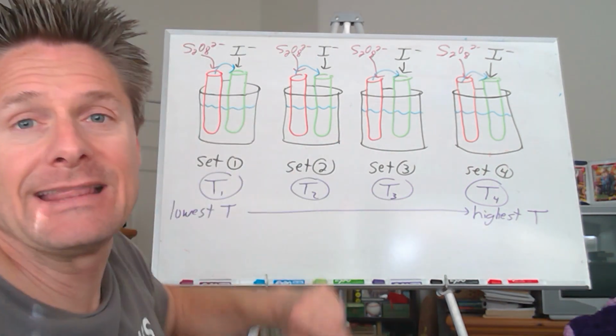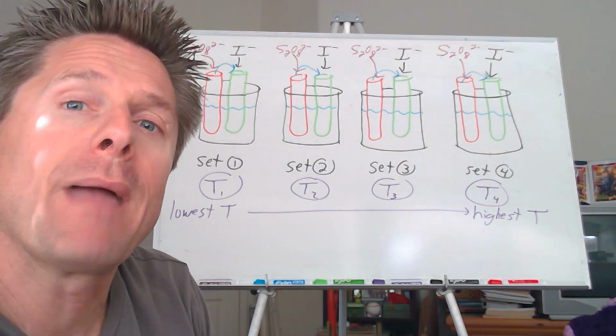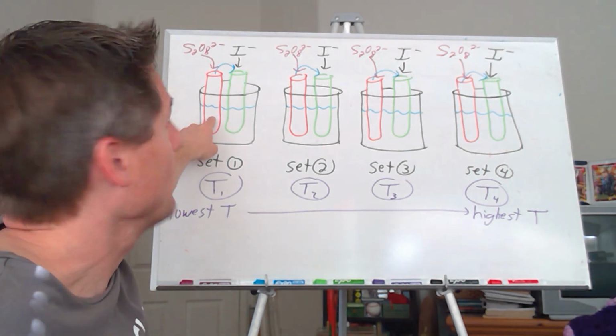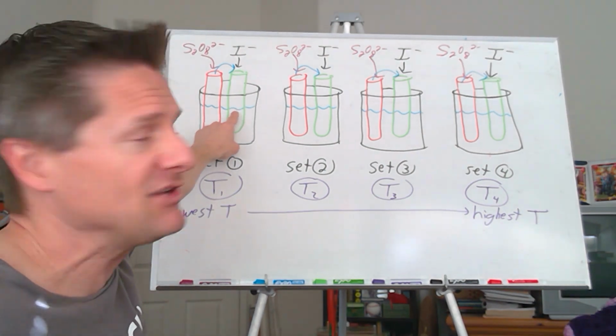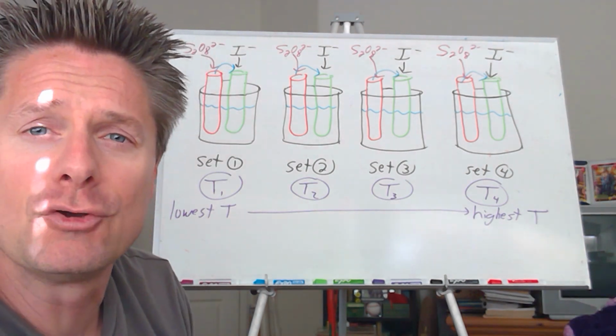And you'll be able to calculate the initial and final concentrations exactly like you did in the kinetics lab. So look back at that pre-lab where I show you how I make this solution, right? That'll be your first M1V1 equals M2V2. Again, we're going to be doing a double dilution. The original solutions in each test tube, you'll have to calculate before mixing using the dilution equation.